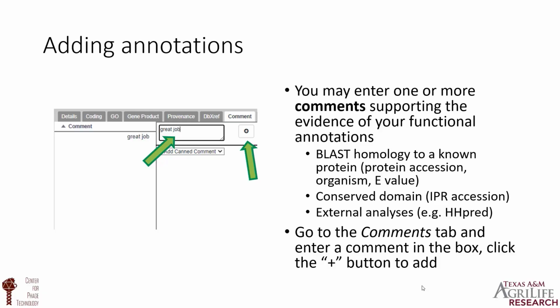And when the genome is exported, these comments will be exported with the record. Before you submit your record to the public databases, though, you may wish to clear out these comments, particularly if they contain large numbers of personal notes.